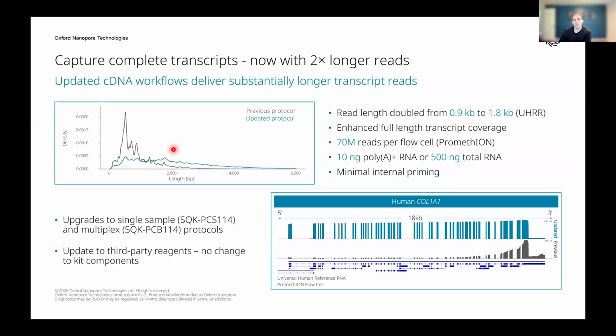And this increase is really important because the longer reads are going to provide better coverage across the entire transcript. And researchers then are going to be able to observe more splice junctions within the same molecule and a clearer view of the transcript structure.